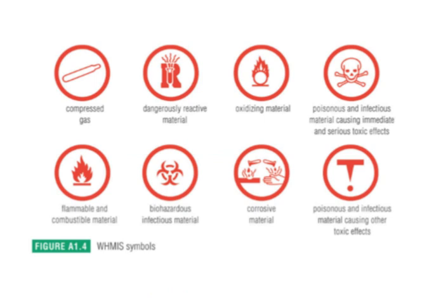Okay. There are some compounds that we even have in the back of our chem lab where they're so reactive that they could just be set off by the littlest thing. Like dynamite might be a good example. It would fall in this category here because it wouldn't take very much, like dropping it or something like that, and it could go boom. Right? Now, it could be more than one. It could be dangerously reactive and combustible. Okay, it doesn't have to be one or the other. But anything that's highly reactive, it doesn't take much to set it off, would fall in this category.